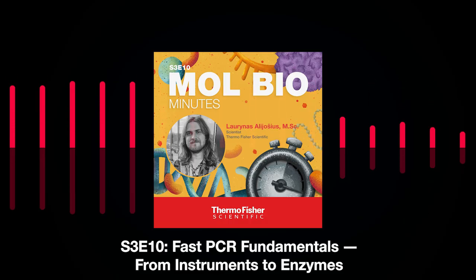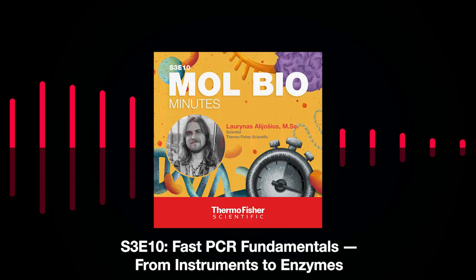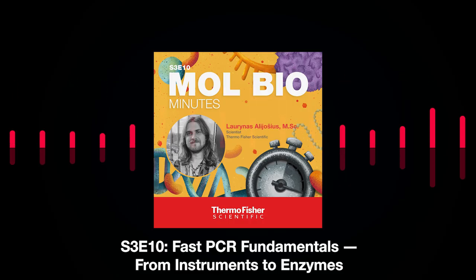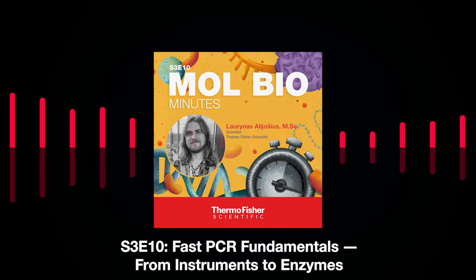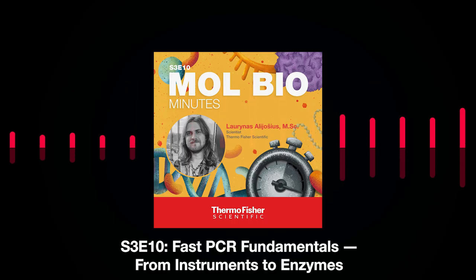So there you have it. You set up your fast PCR, you pick the ramp speed of your PCR instrument, you pick the right PCR consumables, and you selected the polymerase that is convenient for you, and you got your PCR reaction mix and your program optimized. And bam, look at that. Your PCR took way less time than usual. And just like that, your dinner with friends is safe too. So you can have a good time, you can share with your closest people. So you can make it in time for your dinner.